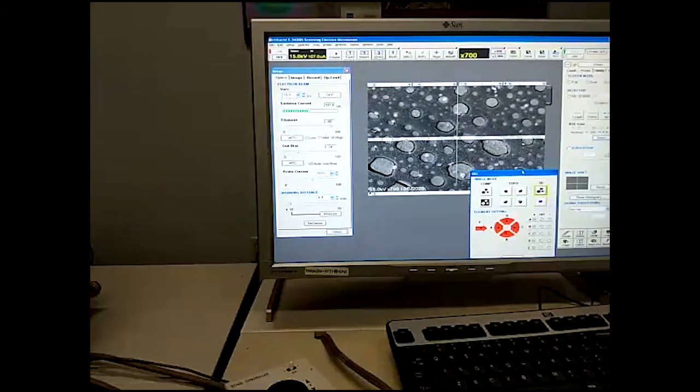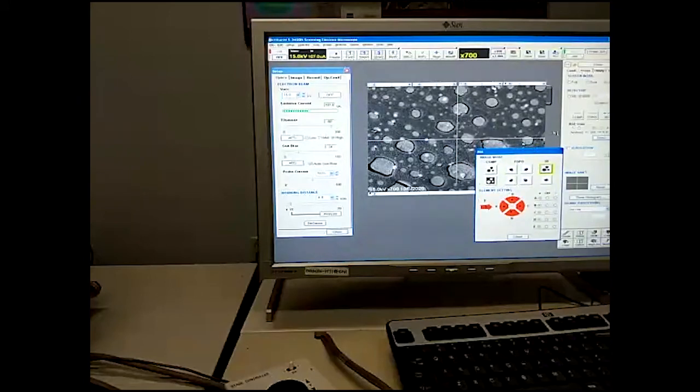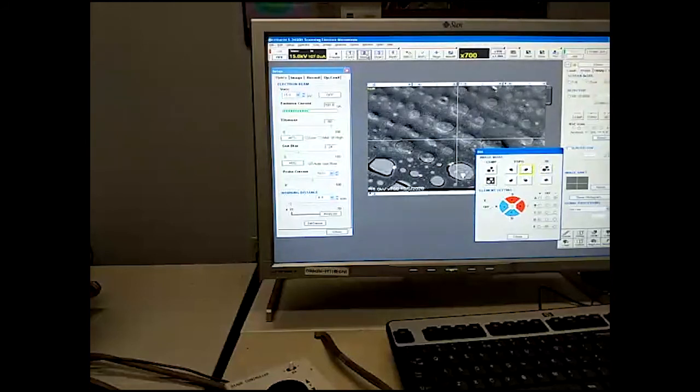Working in the other 3D mode takes a minute to adjust. I have auto brightness link set in the software so that you can automatically switch over. And I'm going to show you that all the detectors in the backscatter work. So there's the 3D with all detectors on. We've got topography from one direction and another. Let's put this on a faster scan. I'm just going to put it on fast too. It'll be a little noisier. I'll show you that it's not a problem with the detectors.